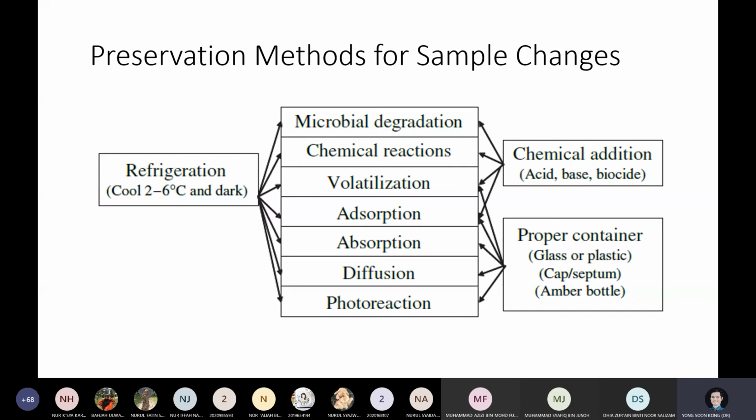But before that, this is possibly one very crucial thing to remember. I think the sequence here, possibly I should teach you about the sampling technique. I mean, preservation and method is the second part, I would say. But anyway, since we're here, now preservation can be said is compulsory. There's no one sampling, no matter what you say, no matter what you do.